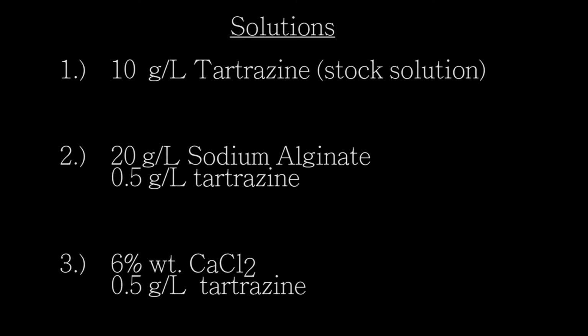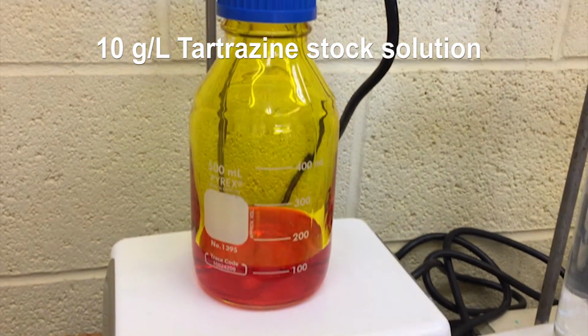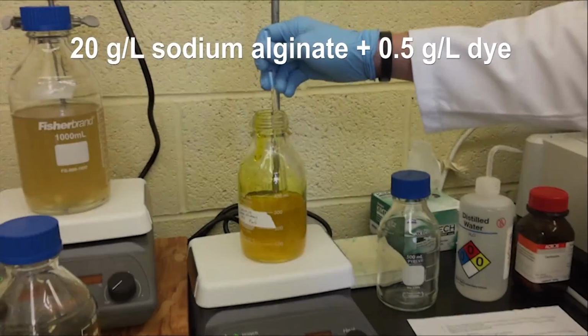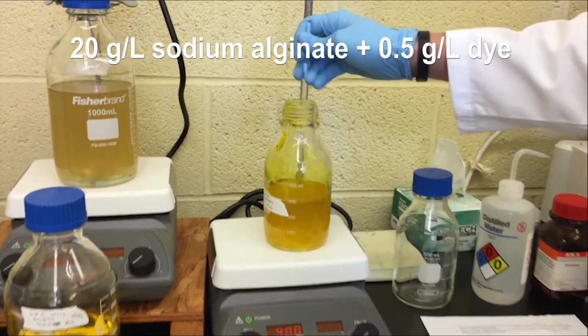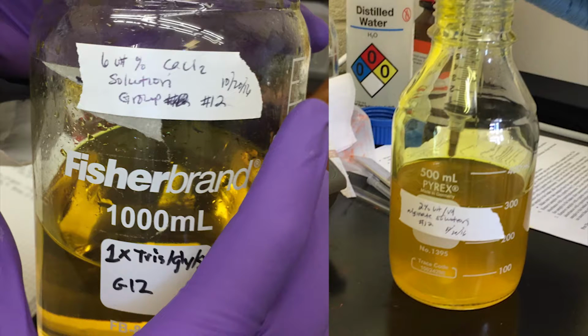The solutions needed for this experiment include the following. A 10 gram per liter tartrazine dye stock solution, which will be used for the calibration curve. A 20 gram per liter sodium alginate solution containing 0.5 gram per liter tartrazine dye, and a 6% by weight calcium chloride solution with the same 0.5 gram per liter tartrazine dye. Notice the tartrazine concentration remained constant for the last 2 solutions. This was done purposely to prevent premature diffusion of the dye.